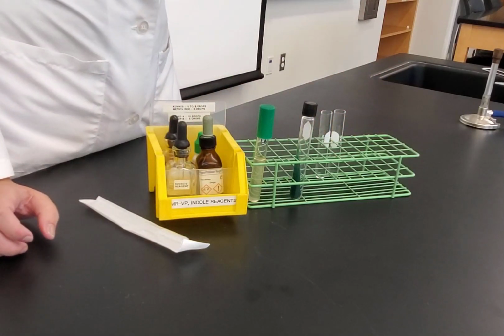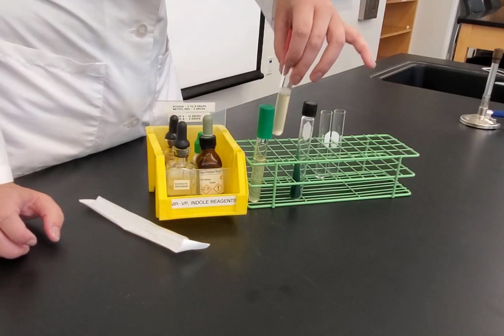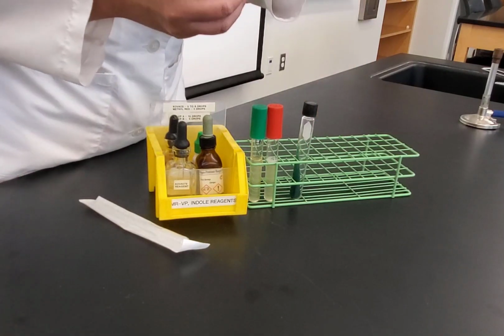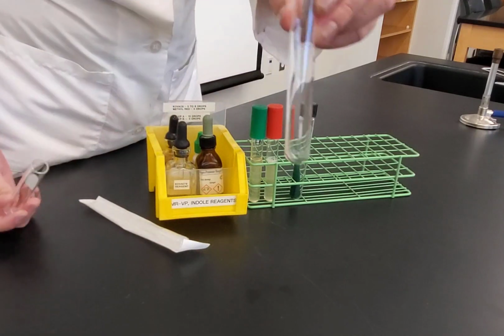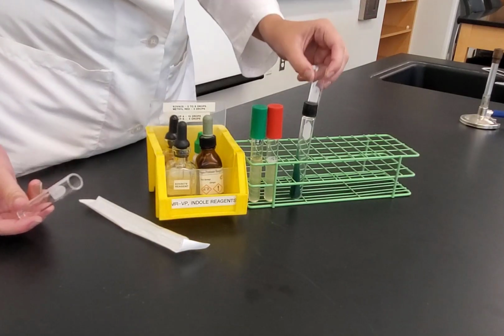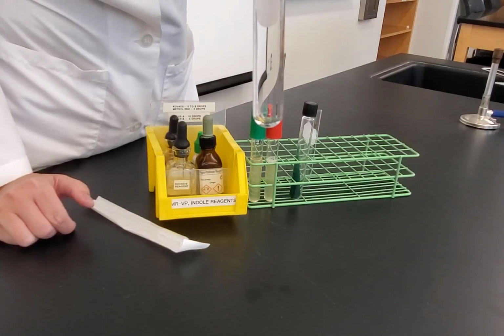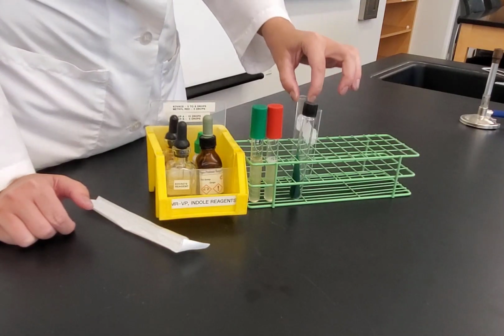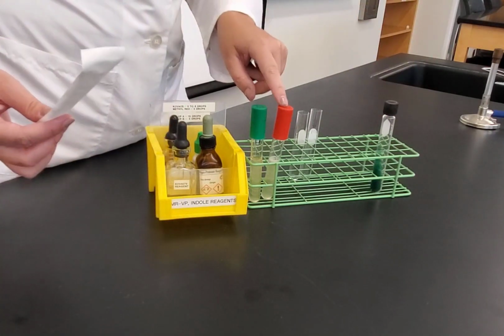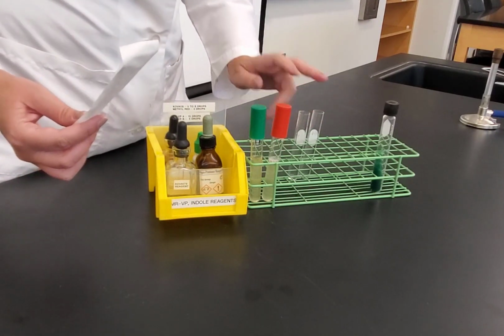And now I need to do my MR-VP broth. So here's my MR-VP broth. Again, we can see turbidity. It grew. It's cloudy. But this broth is going to be used in 2 tubes. So notice I have 1 tube that I labeled EC-MR. This is my methyl red tube. And I have another tube that I labeled EC and VP. This is my Voges-Proskauer tube. So I'm going to move this one aside for a second. I need to use a transfer pipette, and I need to transfer 1 milliliter of this broth to each of these 2 tubes.